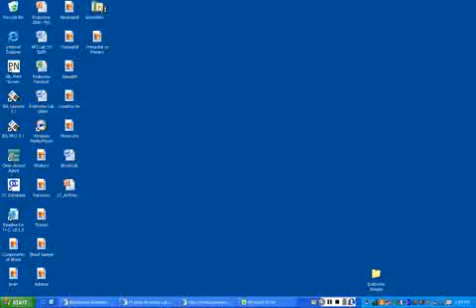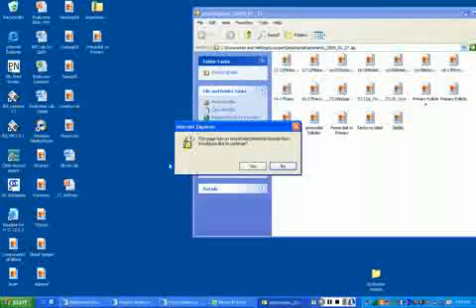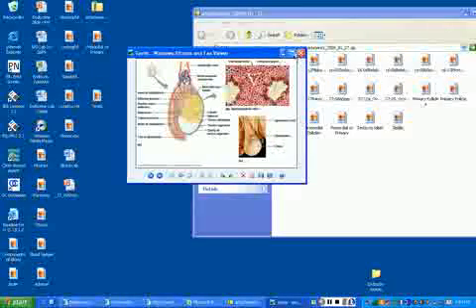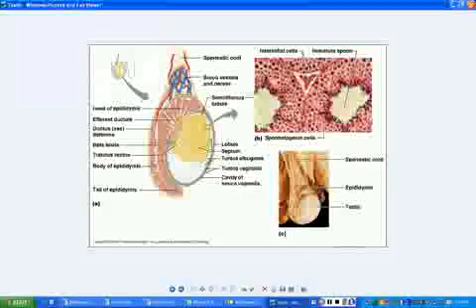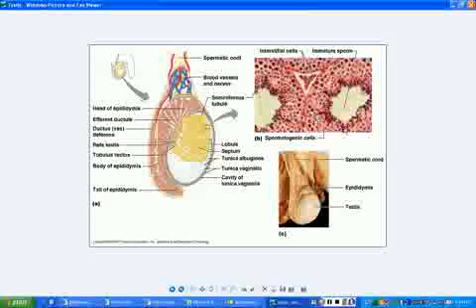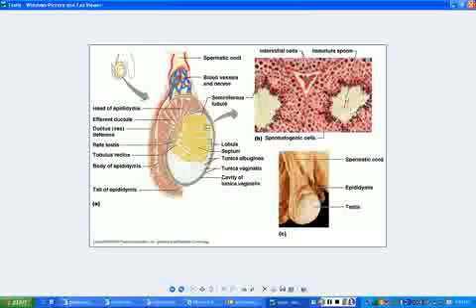All right, next. Oh, the little testes. Let's pull them. Yes, I want to save it there. There it is. Looks like what little fruit right here? Kiwi, but what is it actually? It's a tubule. Way to go, Oz. It's a tubule. It's a seminiferous tubule, right? Because it has a lumen down the middle. Y'all remember that?